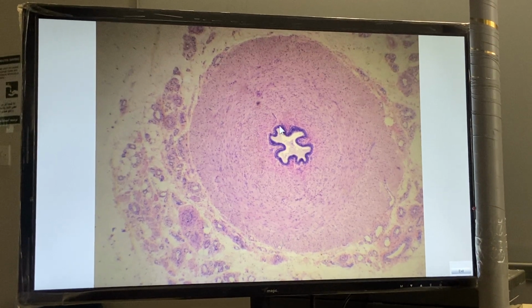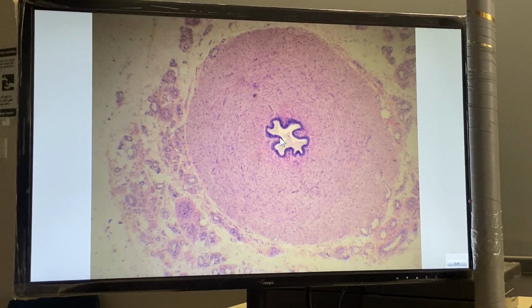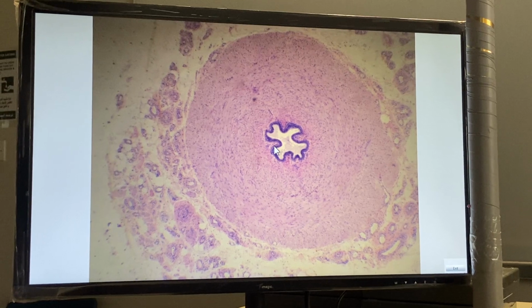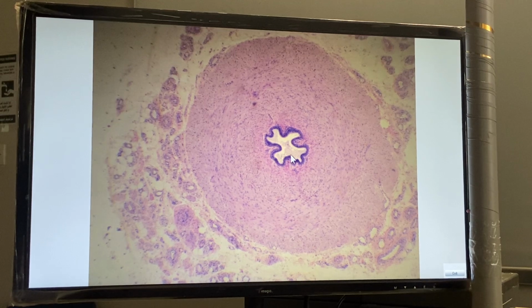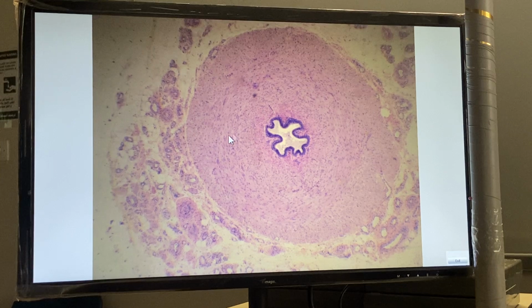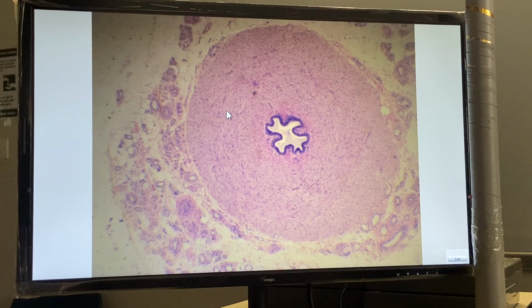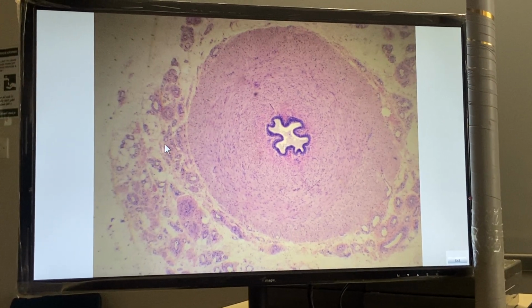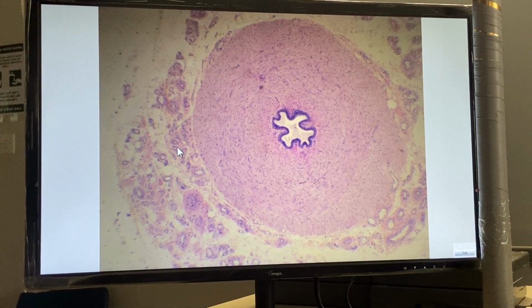This is the mucosa of the vas deferens, which is lined with pseudostratified columnar epithelium. The mucosa is slightly folded longitudinally. The muscularis layer consists of inner and outer longitudinal layers and a middle circular layer. This layer is the adventitia, an external layer of connective tissue with blood vessels.